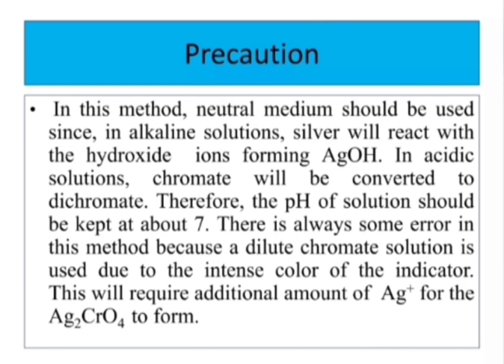Formation of white curdy silver chloride lumps also indicates the end point is near. At this point, silver nitrate solution is added dropwise till the yellow colored chromate ions permanently change to red colored silver chromate precipitate. If required, an indicator blank is run, and then the procedure is repeated to perform two similar titrations in order to obtain a concordant set of readings.